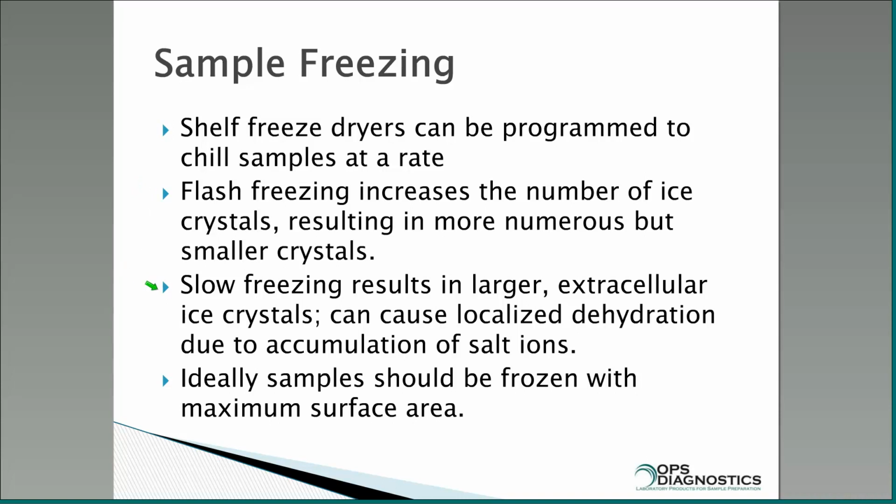Normally, like I said, with your average bacteria, a slow freeze will give you a better result. Any way you look at it, you have to maximize your surface area, especially if you're using a manifold or an ampule. You really have to increase the surface area as much as possible.